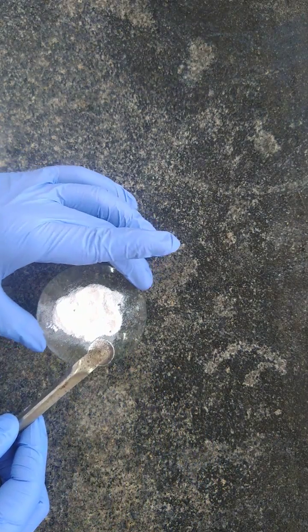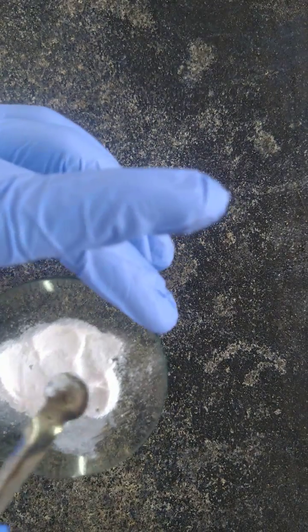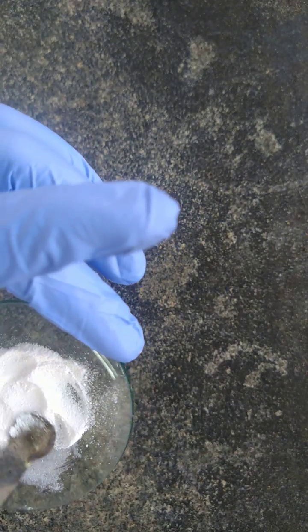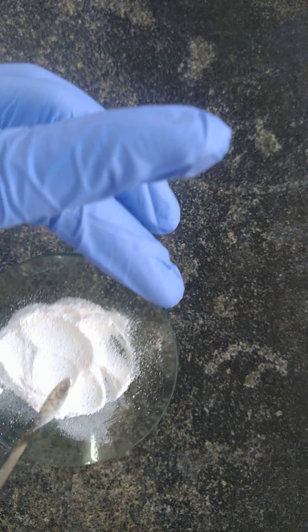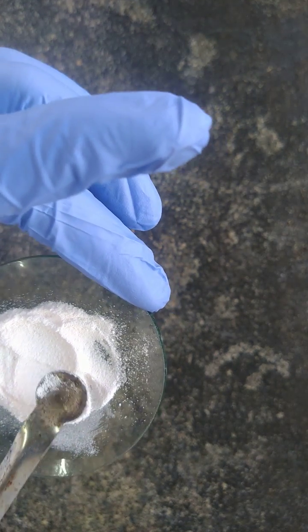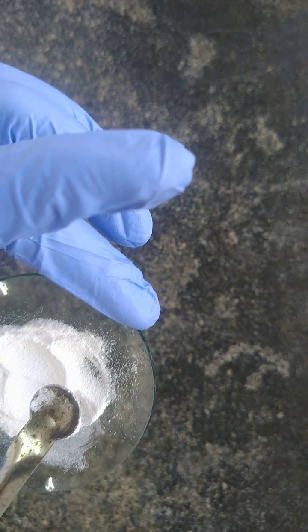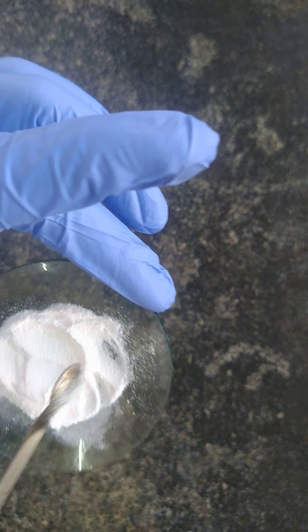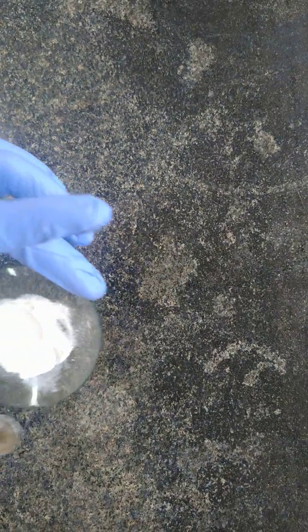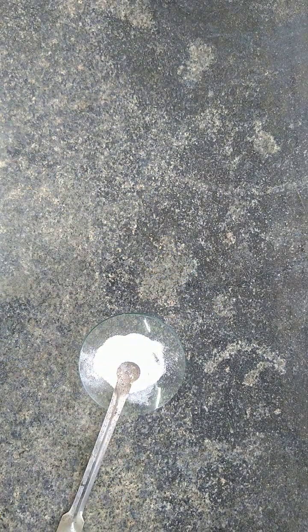So whatever salt has been given in today's experiment, it is a crystalline salt, and this is pale pink in color. Even though it looks like white color, it is very pale pink. So try to recognize properly, it is pale pink. So the color of the given salt is pale pink.